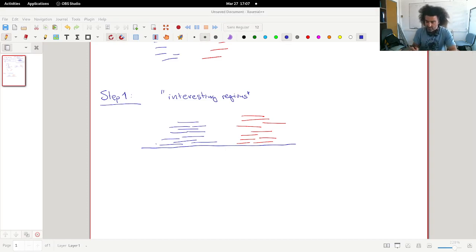Okay, so if this is the distribution of reads in an interesting region, then we can do the following trick, and actually MACS is doing that, in order to fill, let's say, this gap, and also have a higher depth, higher coverage here, which is what we expect, in fact. So to be able to identify the central region where the protein binds on the DNA.